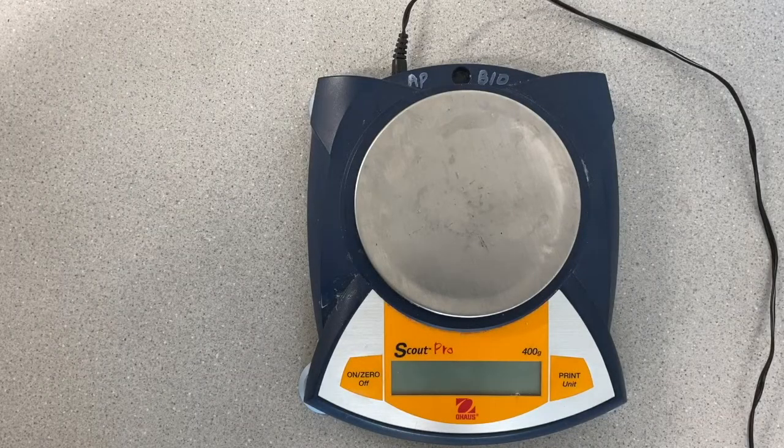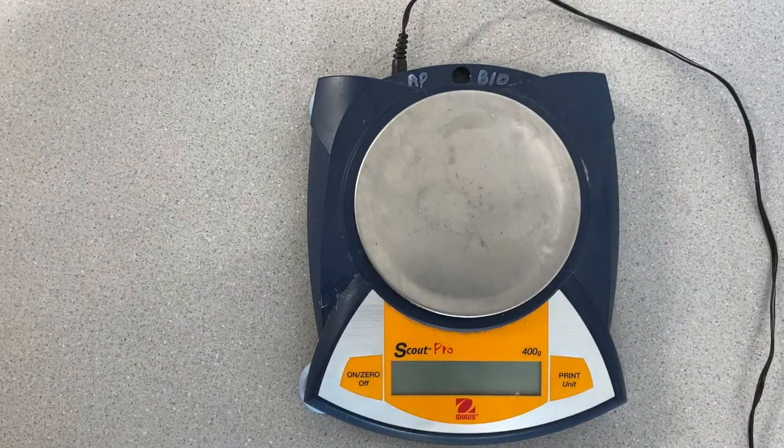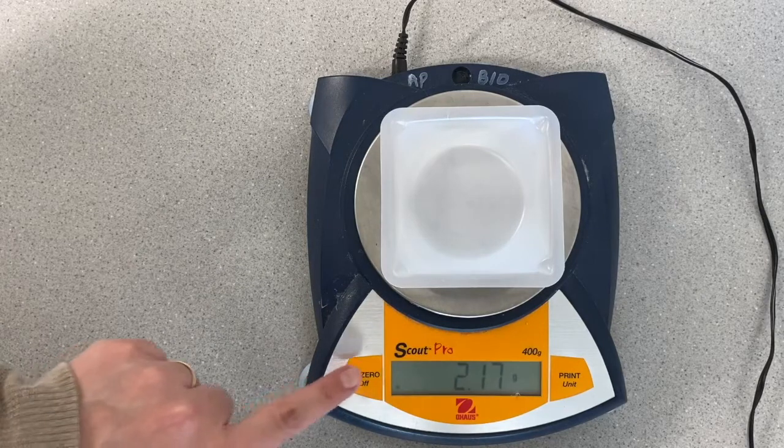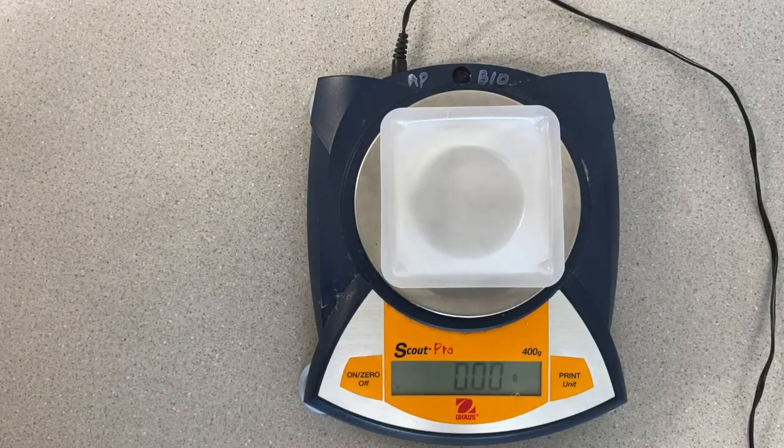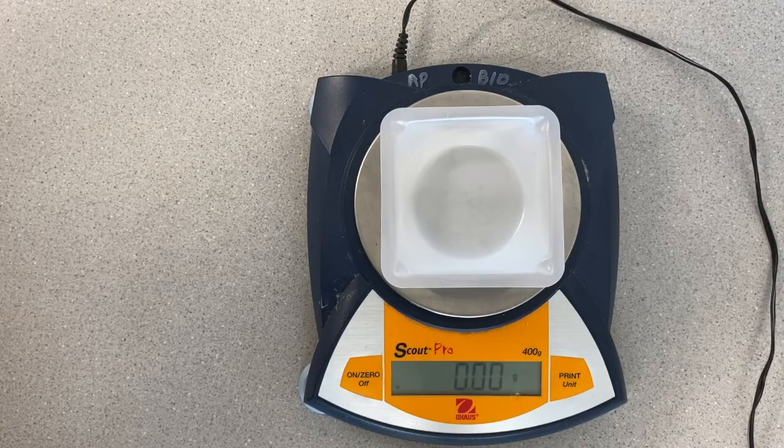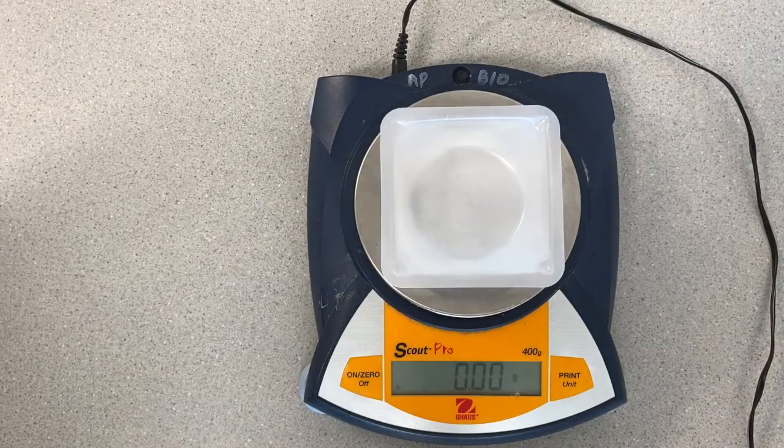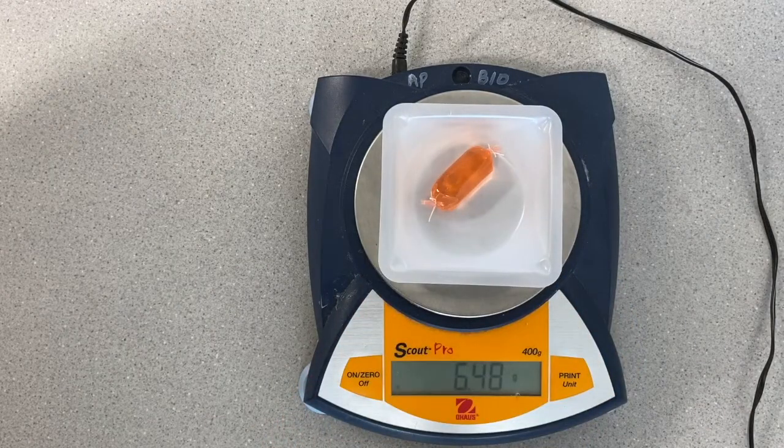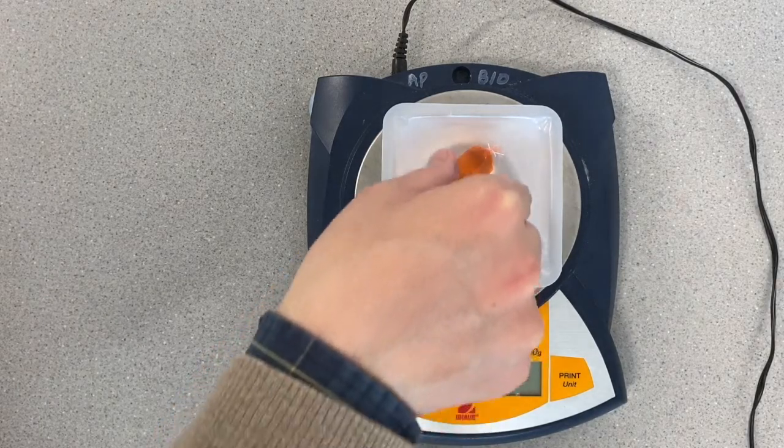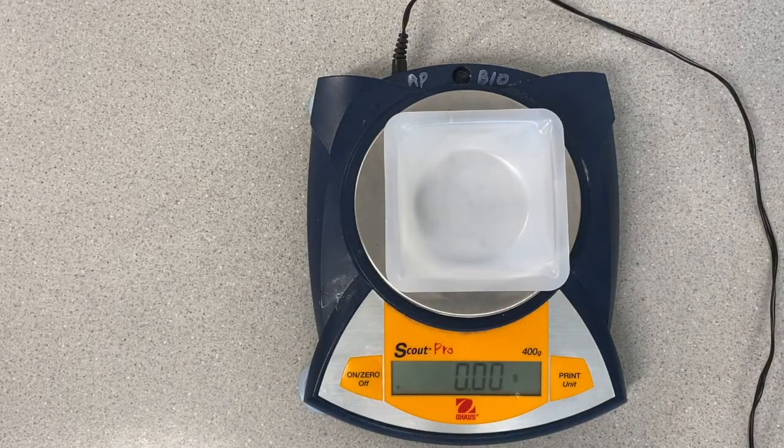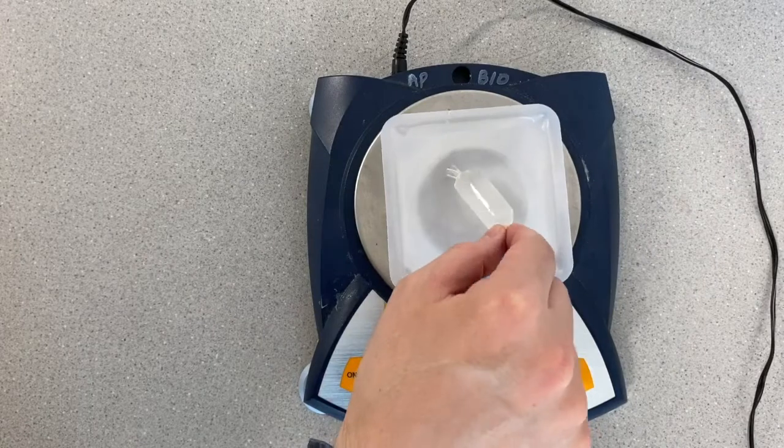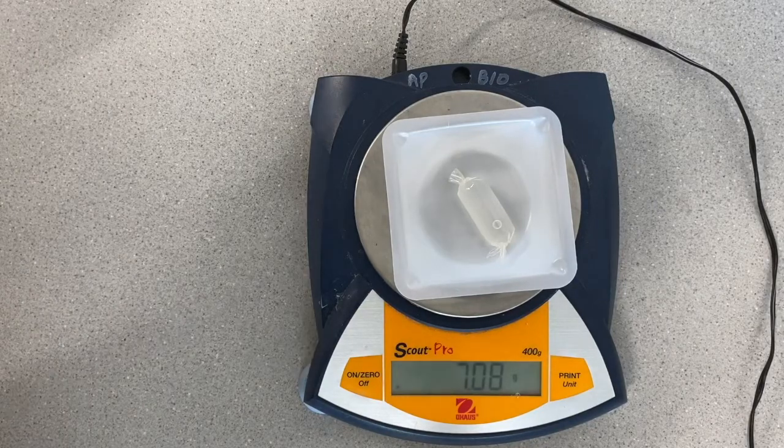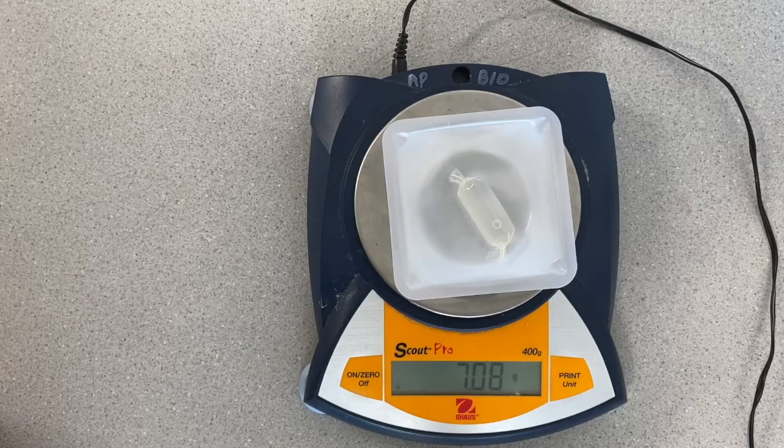Next, we're going to measure the initial mass of both of our cell models. And because that weigh boat has a little mass of its own, 2.17 grams, I'm going to press zero and it's going to ignore that. Now it reads as zero grams. So anything we add to it will be the weight of just our cell model and none of the weight of the weighing boat. So first I'm going to go ahead and take the mass of my glucose cell. And after I've written that down, I can take that out and then take the mass of my starch cell. This will allow me to detect any changes in mass due to diffusion or osmosis after we put this cell model into a beaker of distilled water.